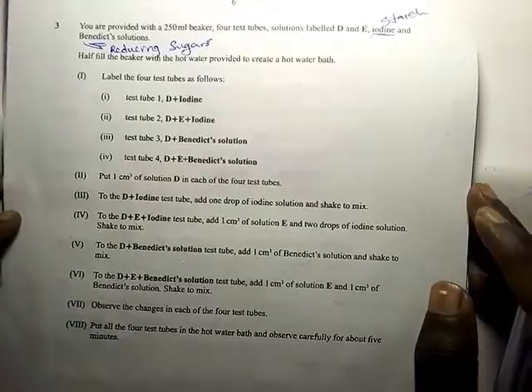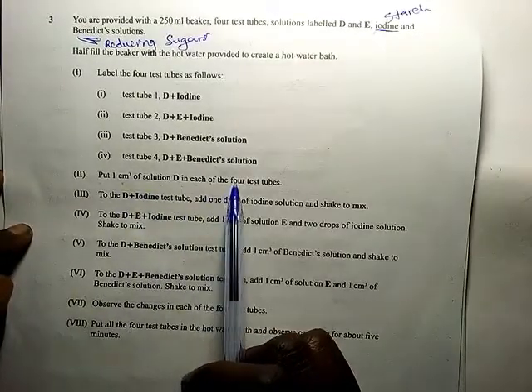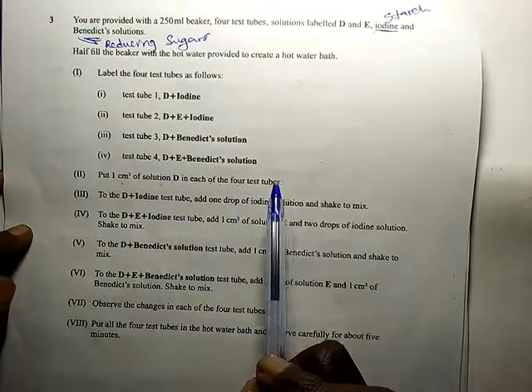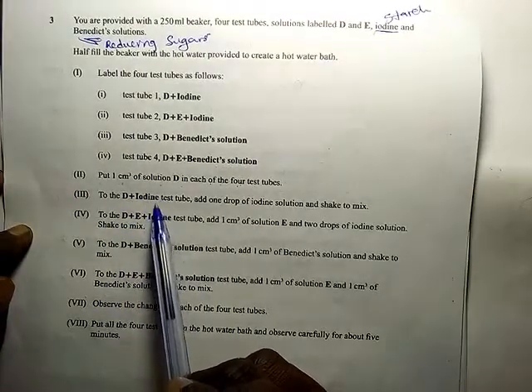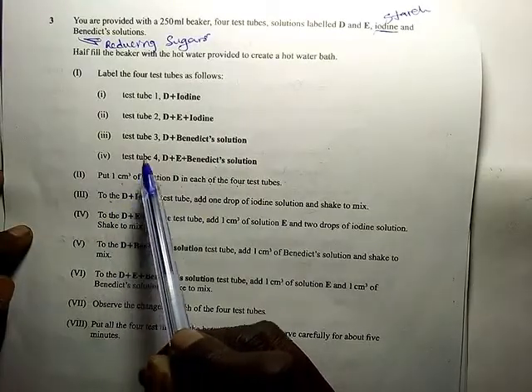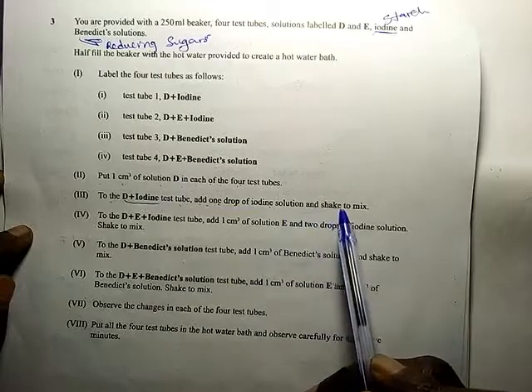In 2, put 1 centimeter cubed of solution D in each of the 4 test tubes. This also means 1 milliliter. Put 1 milliliter of solution D in each of the 4 test tubes. In Roman 3, to the solution D and iodine in test tube 1, which you labeled D plus iodine, add 1 drop of iodine solution and shake to mix.